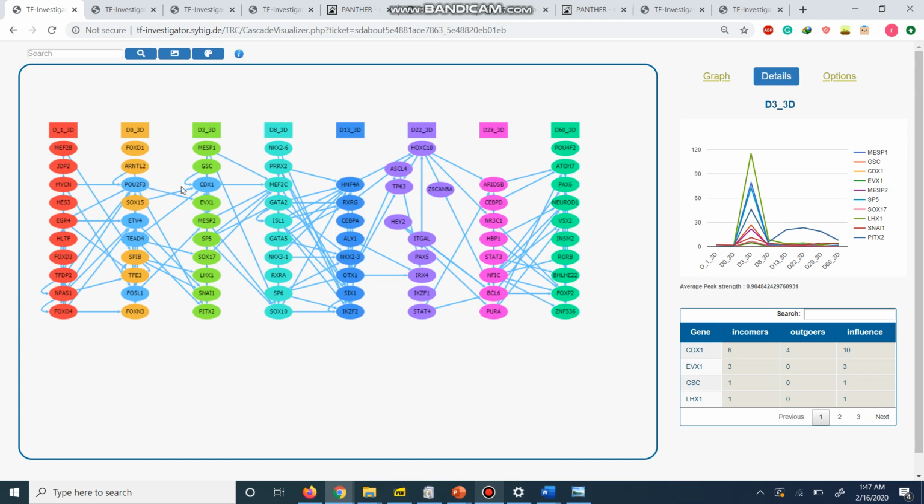However, as the nodes are highlighted for examination, the view might be messy. In the end, you can always click repaint and the nodes will regain their color. You can also autofill and fill in one of the genes and it will be highlighted.